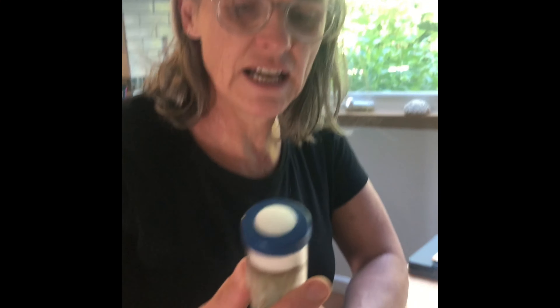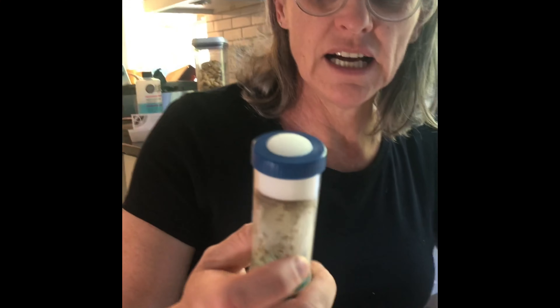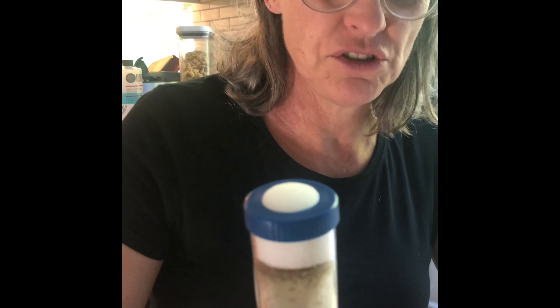Hello everyone. I have a Drosophila cross here, and your job is going to be to phenotype these flies for us, and then we can project what the cross is.